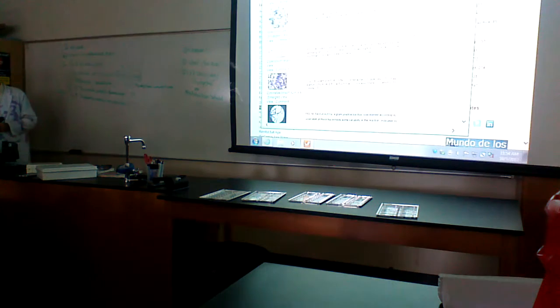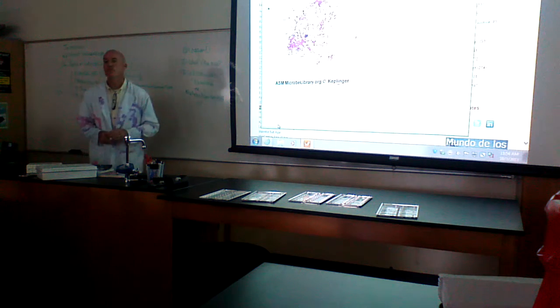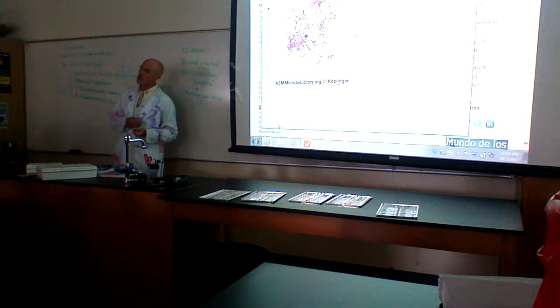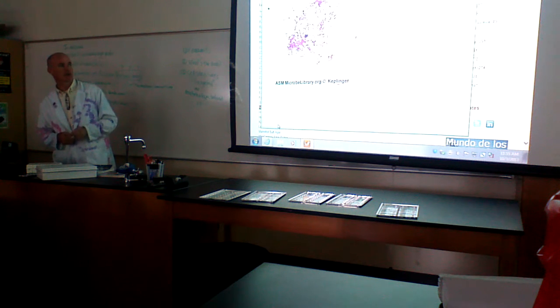All right. What is the acid fast stain telling you? A waxy cell wall. Yeah. So remember when you were spreading these, it was like wax. If you didn't spread them out really well, it was exactly like spreading wax in a liquid.